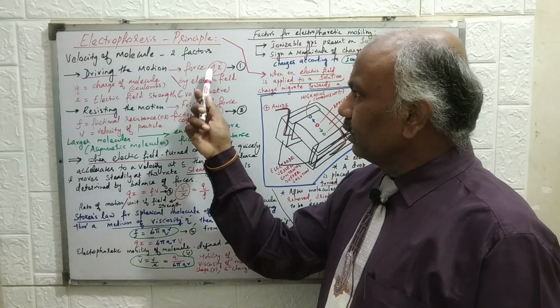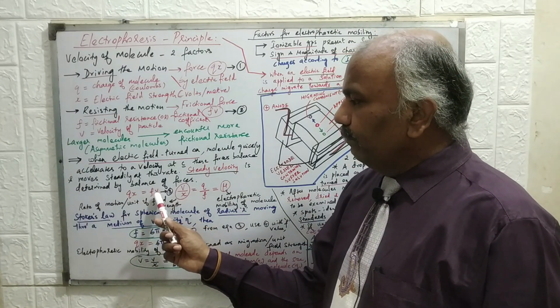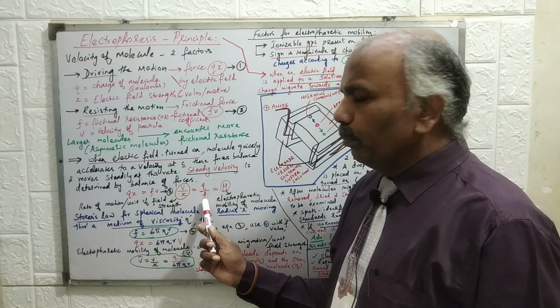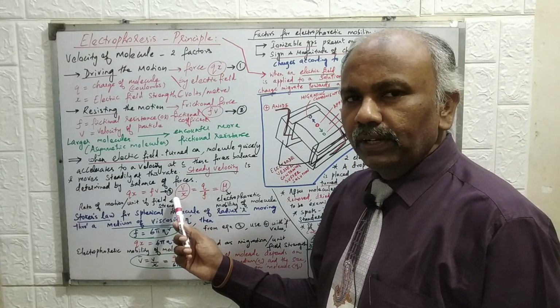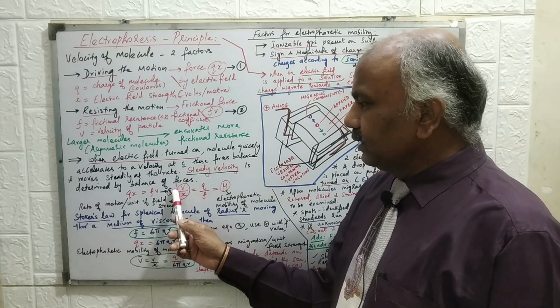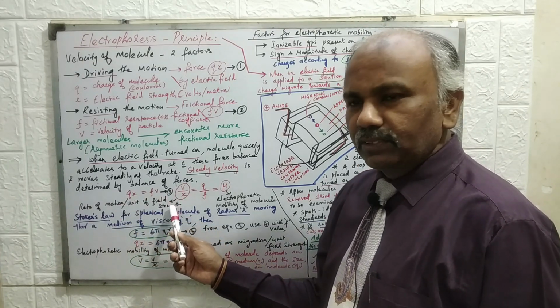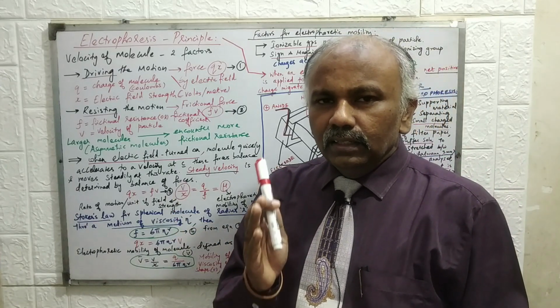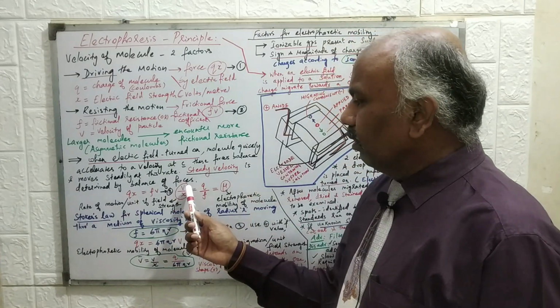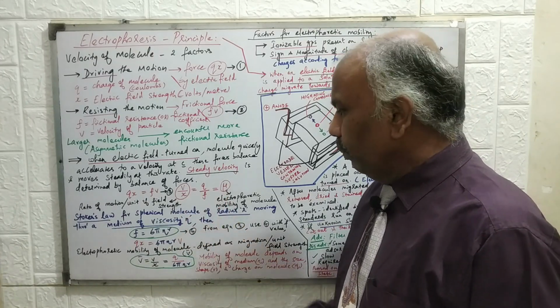So we can say that Qx is equal to Fv, or simply we can say v by X is equal to Q by F. What is v? v is the velocity and X is the electric field strength. Right? So that is nothing but the rate of motion per unit of electric field strength. Rate of motion is nothing but velocity. Velocity by electric field strength is also called electrophoretic mobility, which is given by the terminology mu.